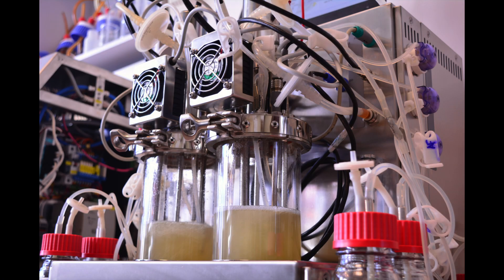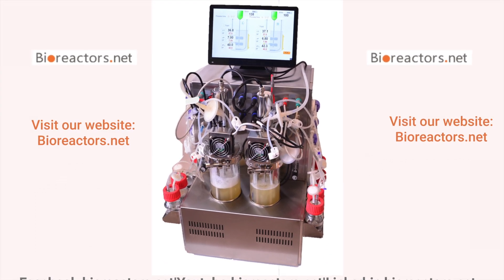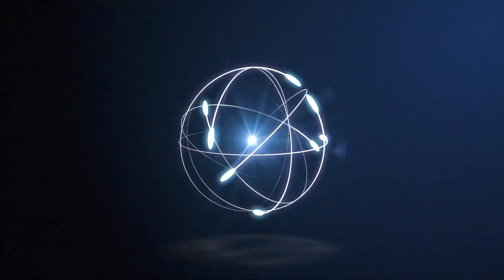The possibilities of this bioreactor are wide as you can see. We have different extensions and optional possibilities, and our engineering team is ready to adapt these products to your special needs.